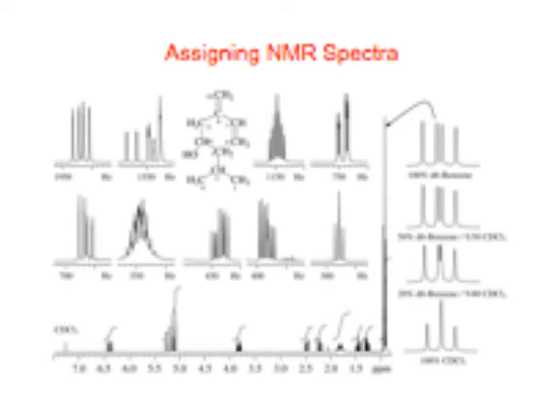I'm trying to remember, do we have another chiral center? Oh, the one behind it. This is a chiral center right here. They haven't shown us the chirality, whether it's R or S, but we have one chiral center here. We've then created another chiral center here.